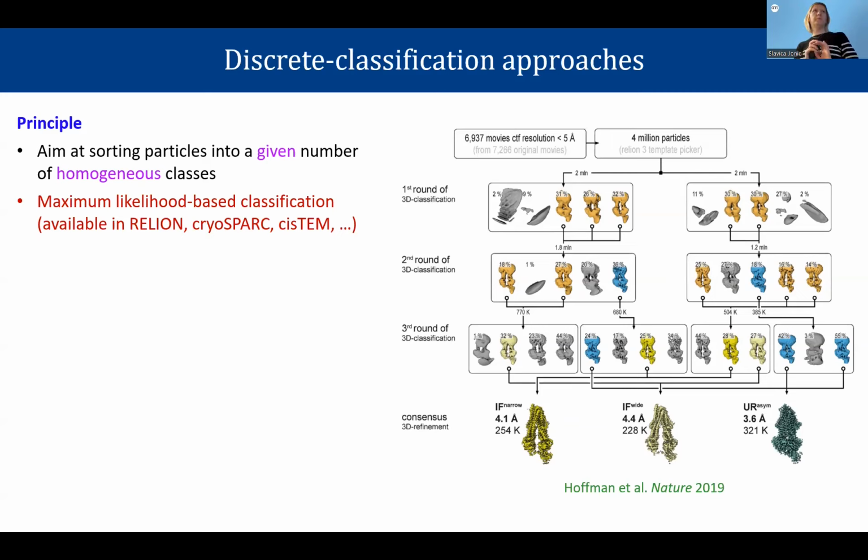It will not be a blob, even if you have quite some differences between the shapes. So yes, the classical approach is to run these classification procedures many times, then find a good number of classes and then merge classes.